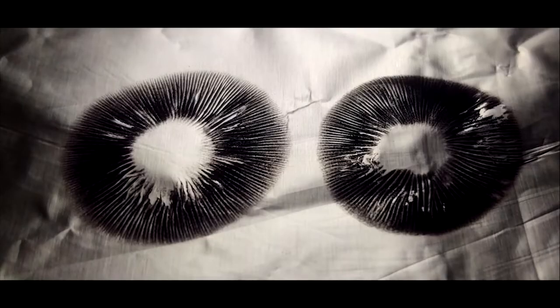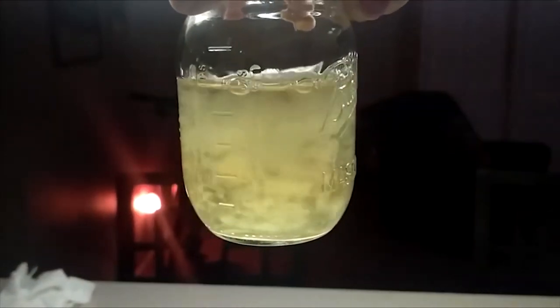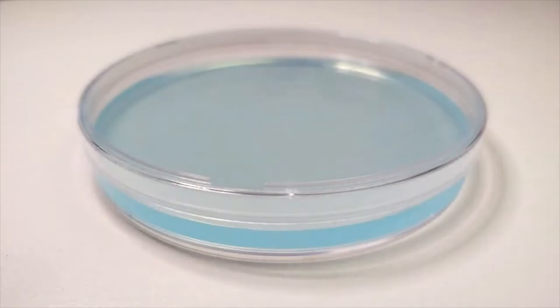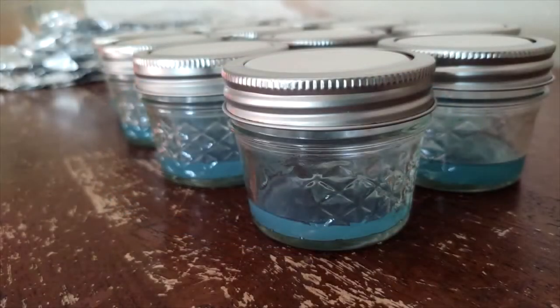When working with spores or cloning best fruits, it is always our goal to create a liquid culture. Liquid culture is mycelium suspended in nutrition. It's like a liquid Petri dish without the agar in a jar. To achieve this, whether we're starting with spores or cloning, we begin the process with agar dishes.